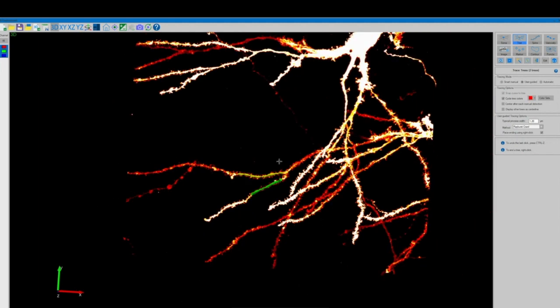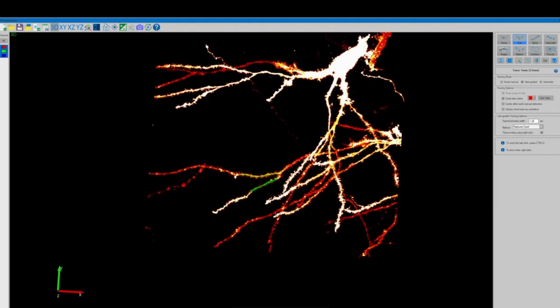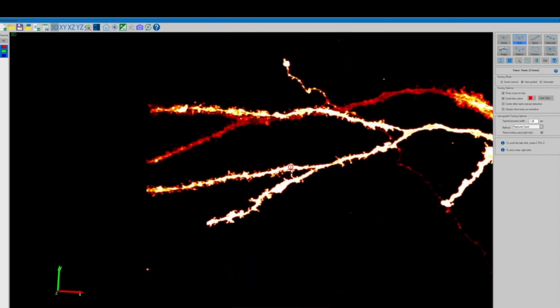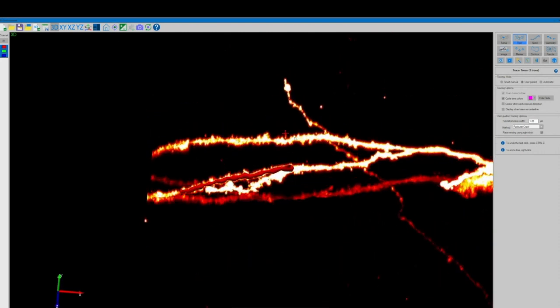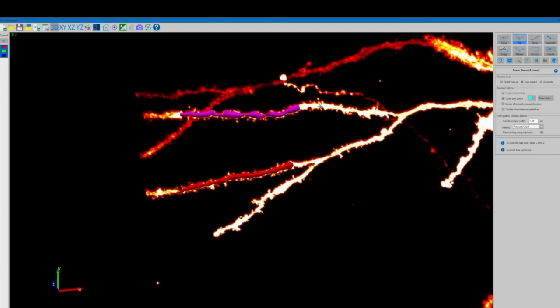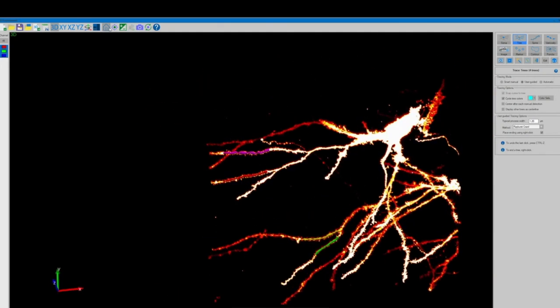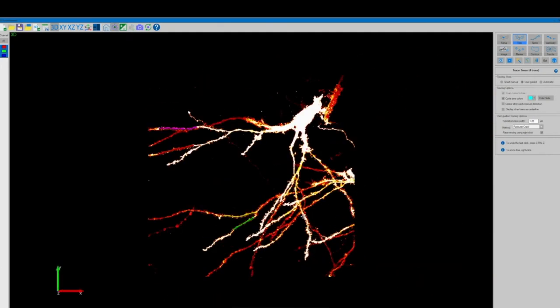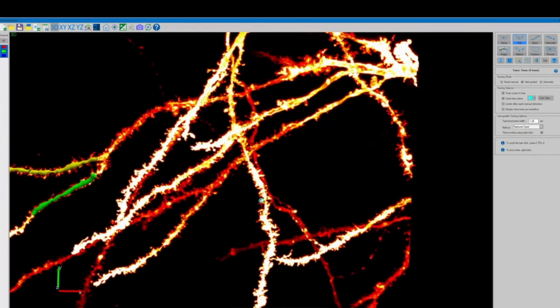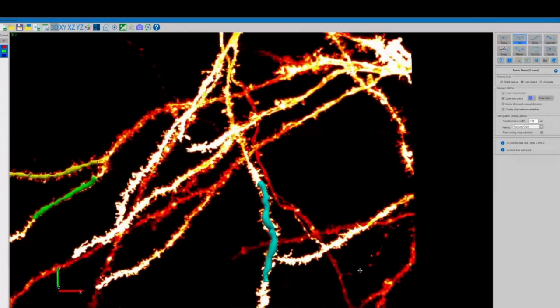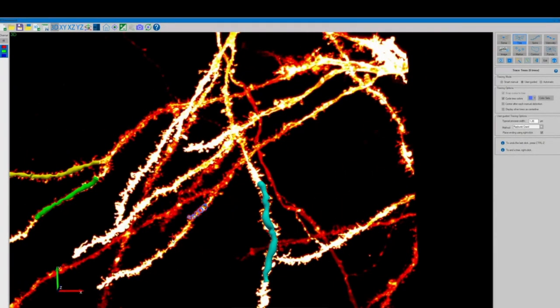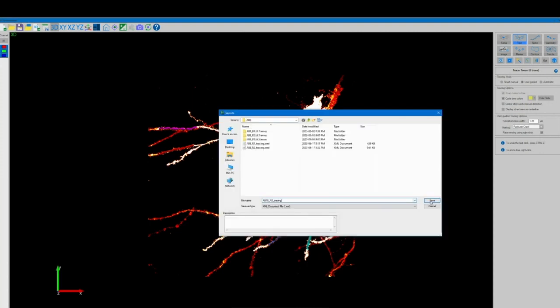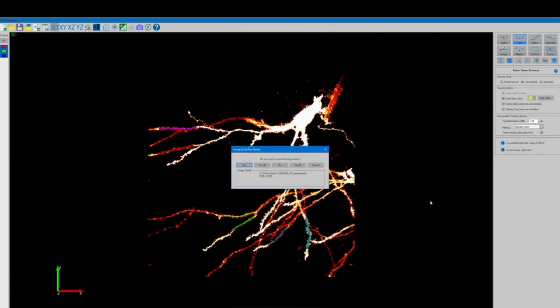Once all of our tree segments have been detected and traced there are many different user-friendly editing options available on the right hand side of the screen where it says edit. It's super important that our tree tracings are accurate as the more accurate these are the more accurate our automatically detected spine counts will be. Throughout this entire process it's also good practice to repeatedly save our tracing in the case of the program crashing. This can be done with the purple save tracing icon in the top left corner of our screen.